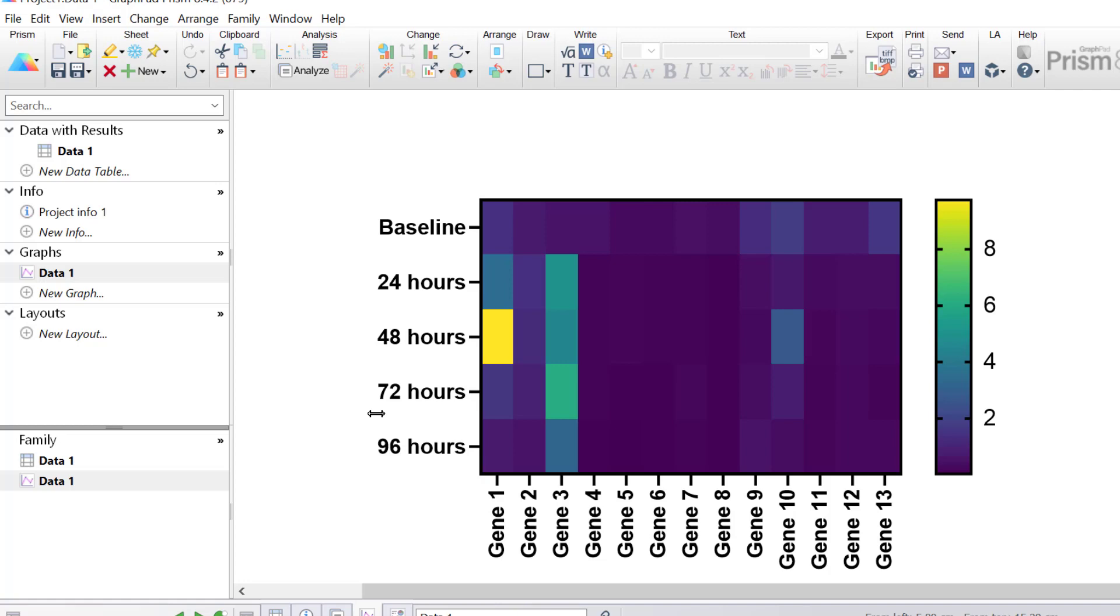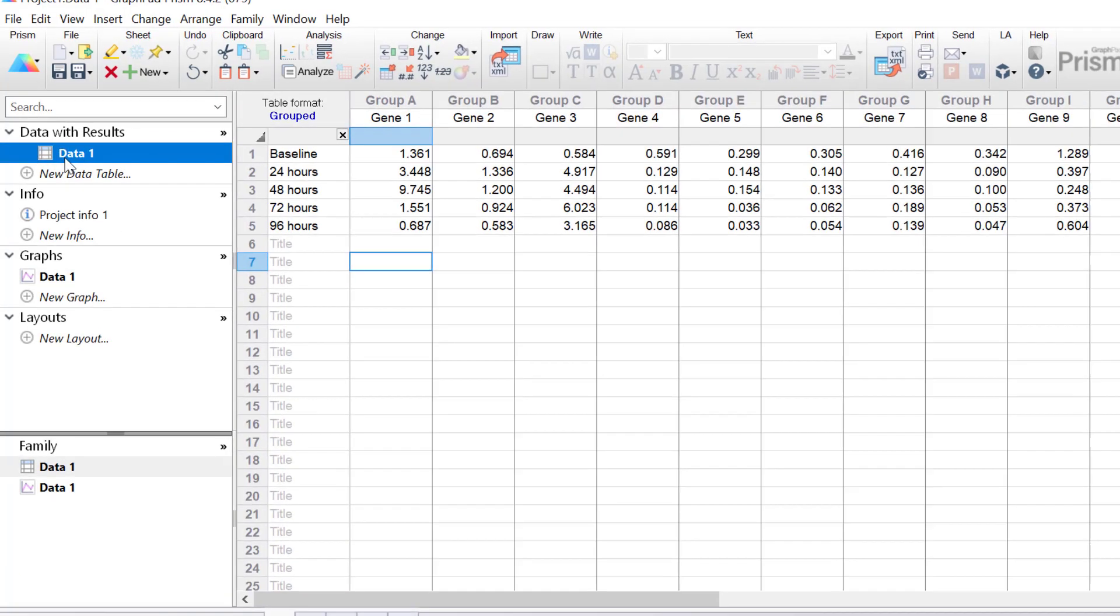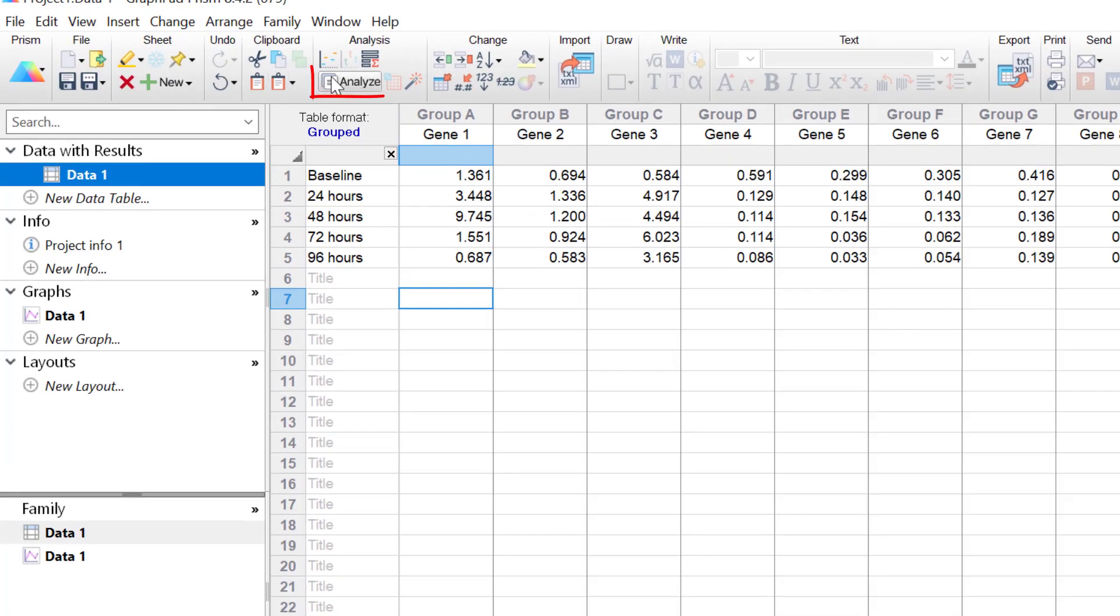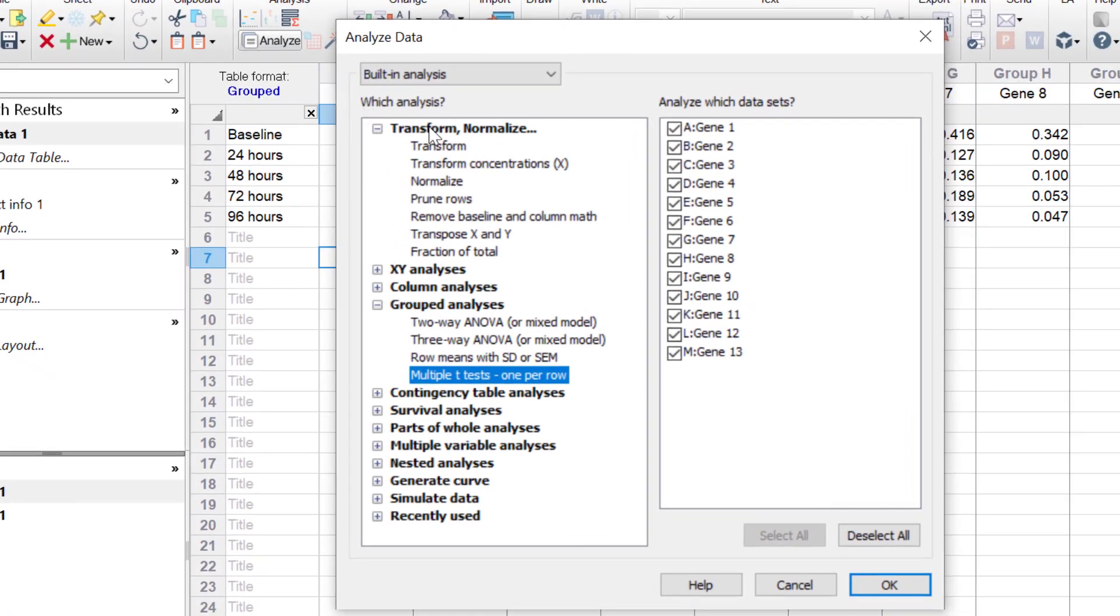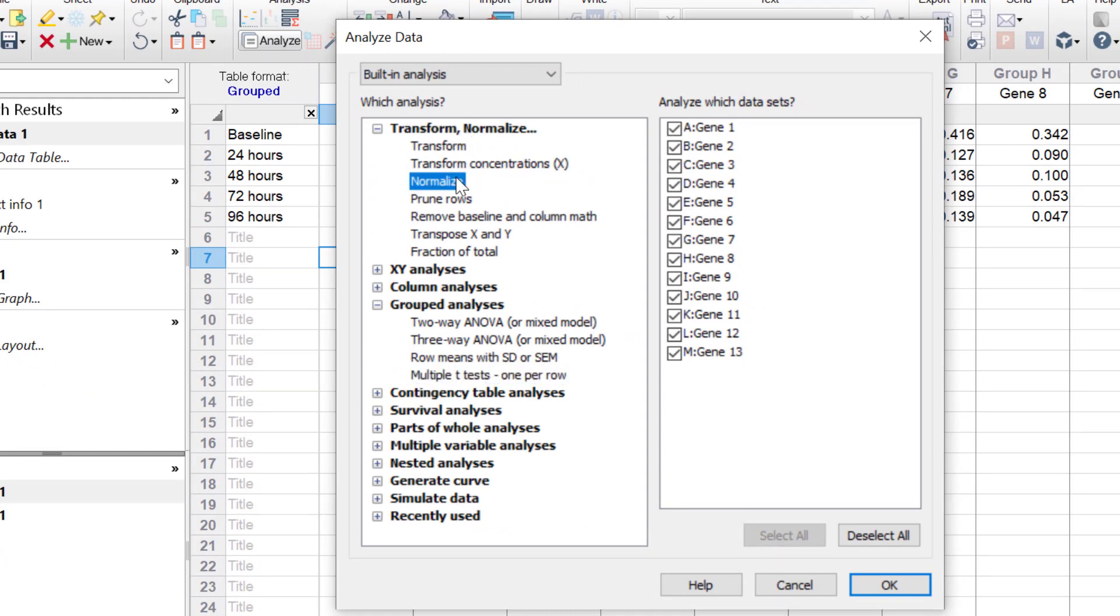At the minute, the raw data does not achieve this, since it is taking into account all of the data for all of the genes. So to normalise my data, I will click on my data table, I'll then click the Analyse button at the top. Under Transform and Normalise, I'm going to select the Normalise option.